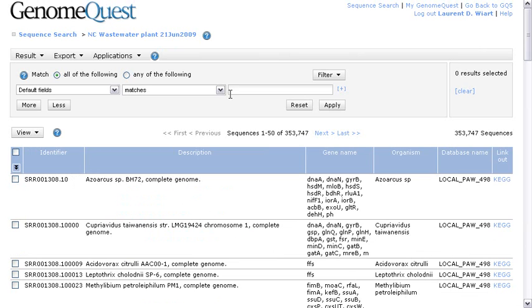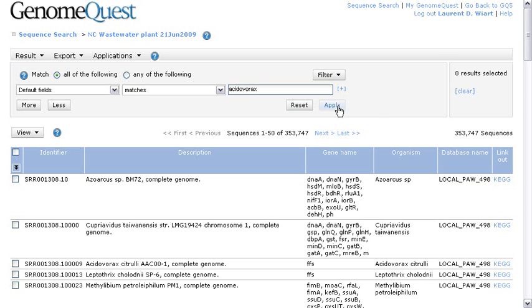Now, what I want to do is to focus on the ACIDOVORACS reads, the reads that have been annotated by ACIDOVORACS sequences. I just have to type this keyword here, and press Apply, or hit the Enter key.